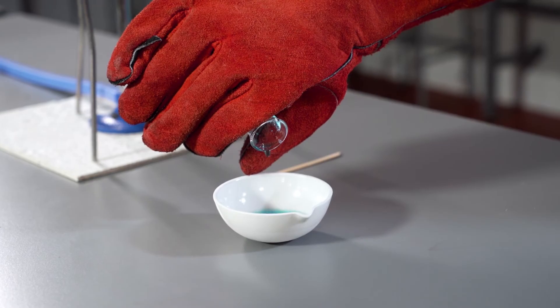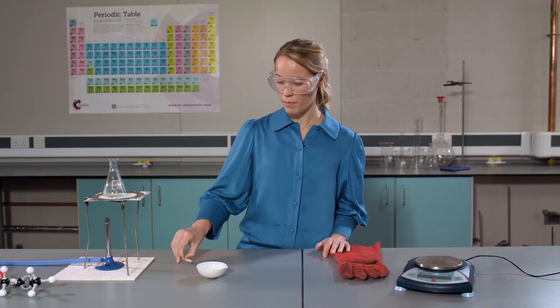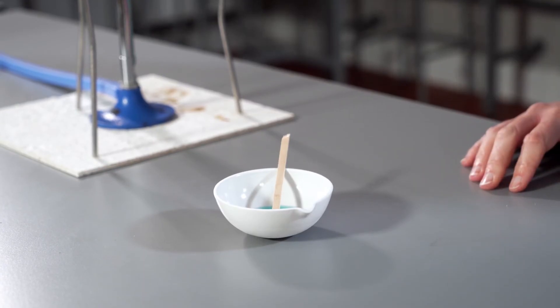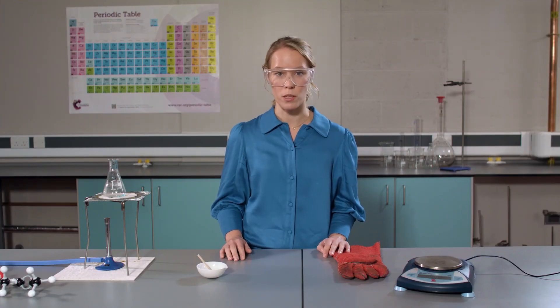If the crystals don't form quickly, we can use a wooden spill and place it inside the evaporating basin. This will speed up the reactions as it creates a rough surface for the crystals to form on.